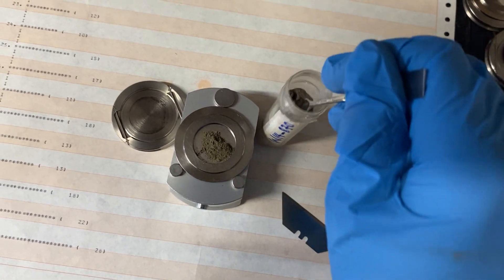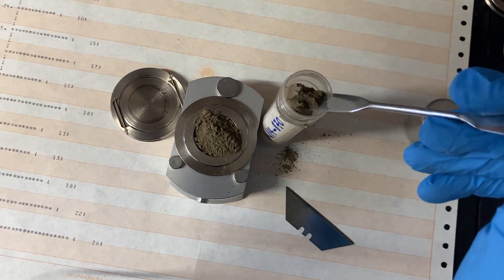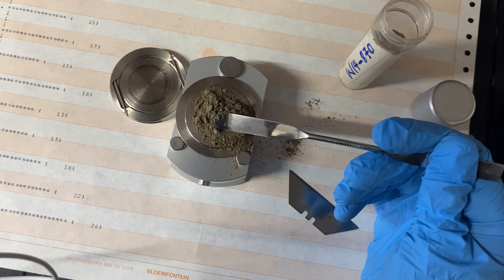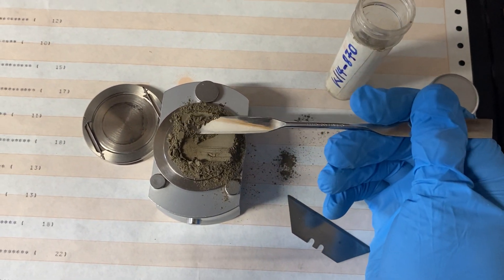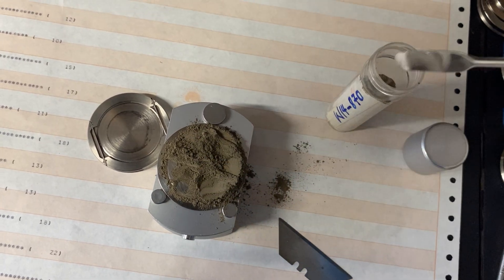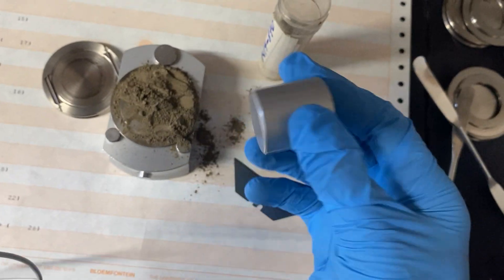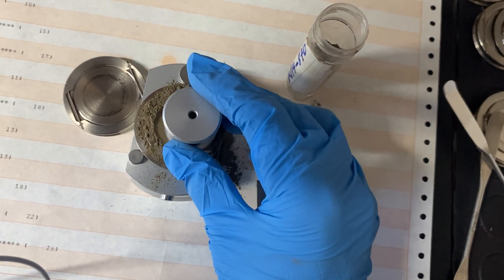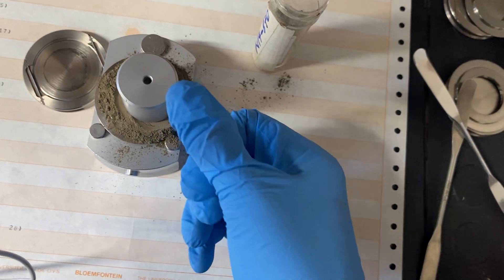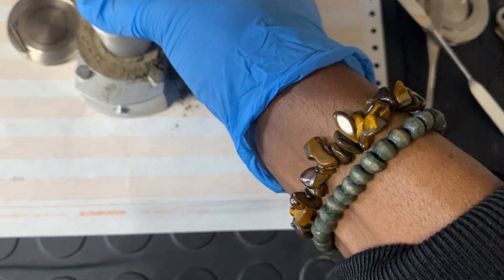We overfill the well, and then use the spatula to make sure the powder is evenly distributed. We can add a little bit more powder if needed. Now we compress the sample — first gently, and then we use the press block to firmly and evenly press down the sample with a strong force. This step is crucial to ensure that the powder is compacted and the surface is as smooth and as flat as possible.